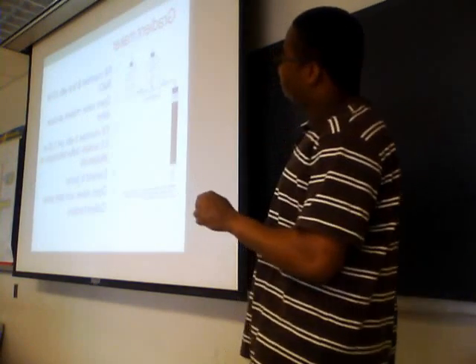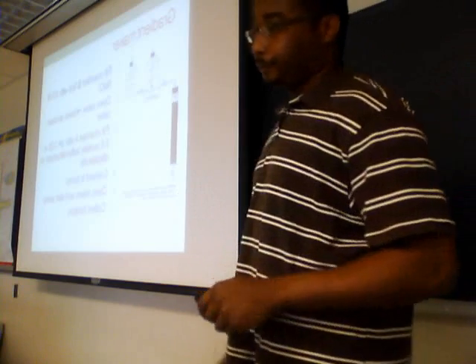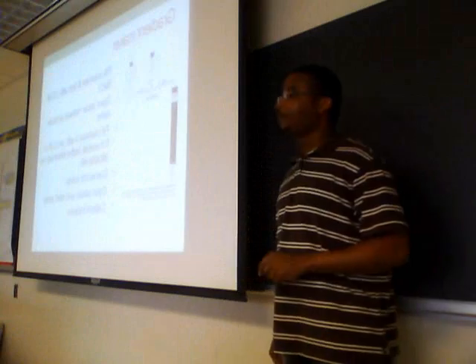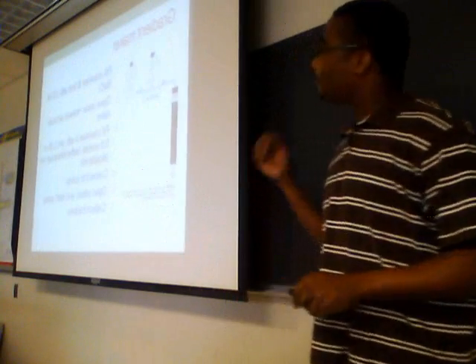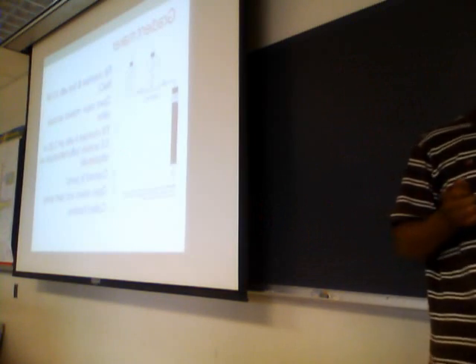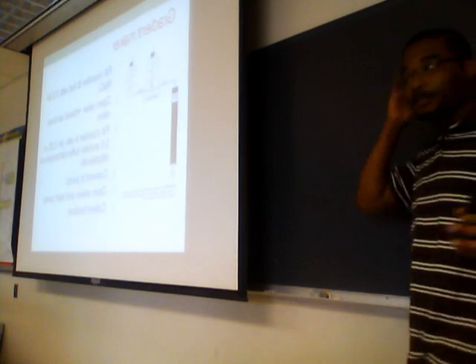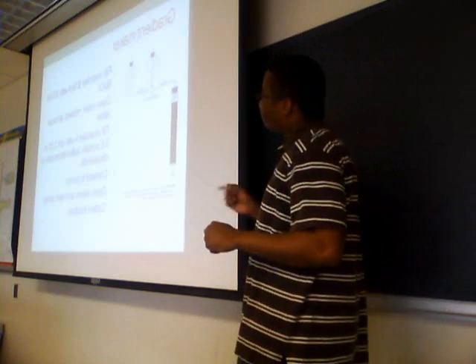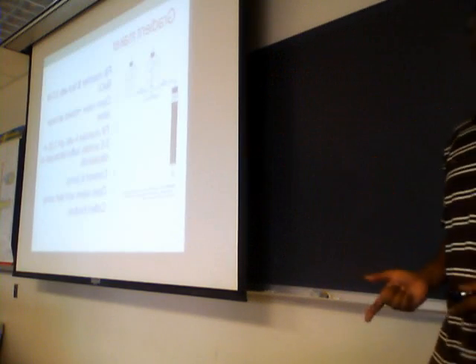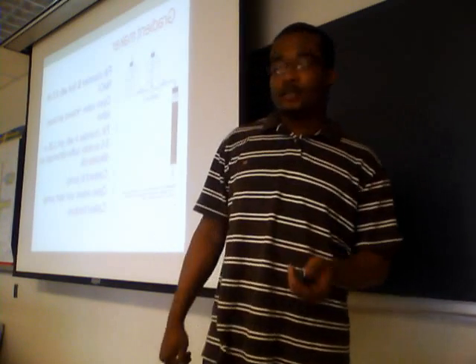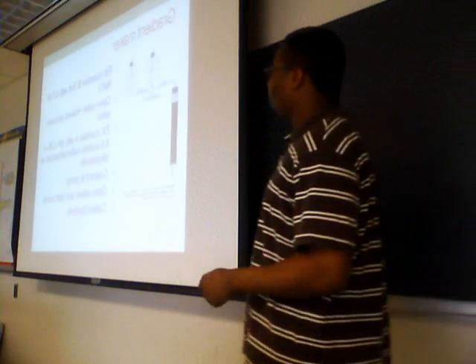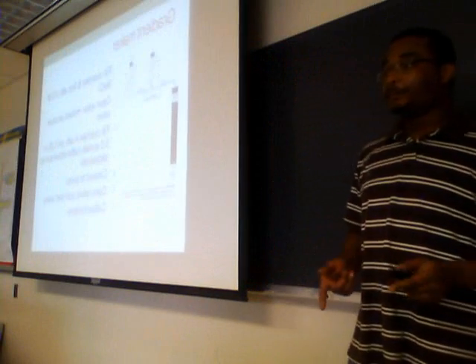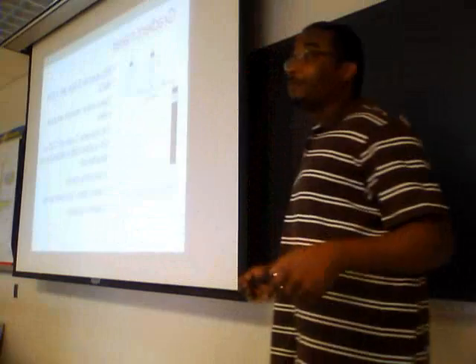Here is the gradient maker we're going to use. Fill chamber B with 0.5 molar NaCl first, then open the valve between the chambers to bleed out any air, and close it back up before starting the elution. Chamber A — notice there's a stirrer under it — is filled with the pH buffer, either 3.25 or 5.0. Place a stir bar in it and put it on the stir plate to begin stirring. Then connect the pump, open the valve, start the pump, and collect the fractions.